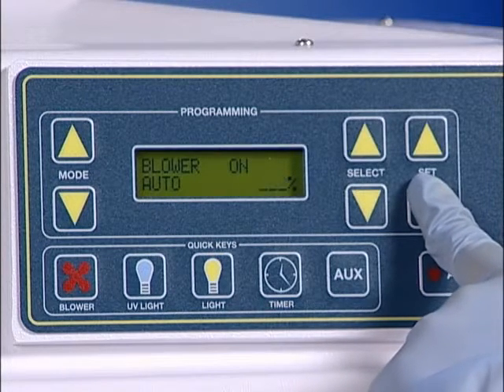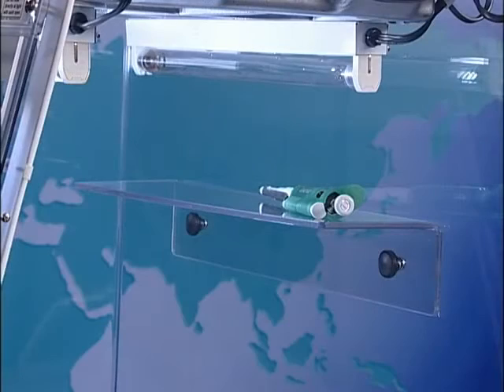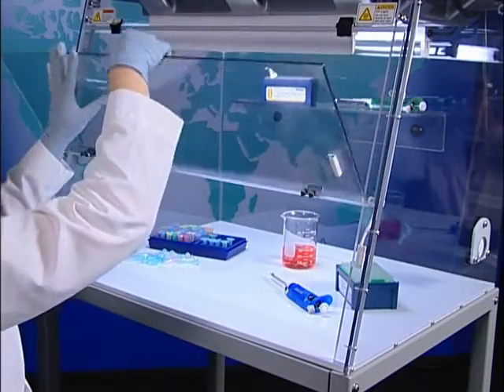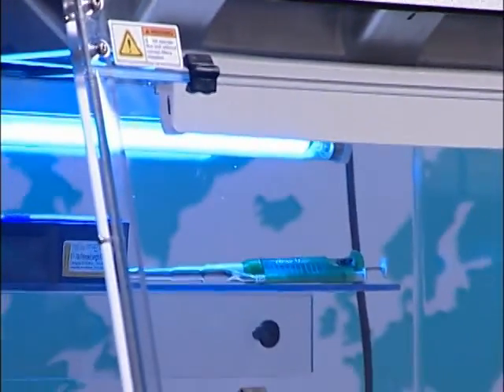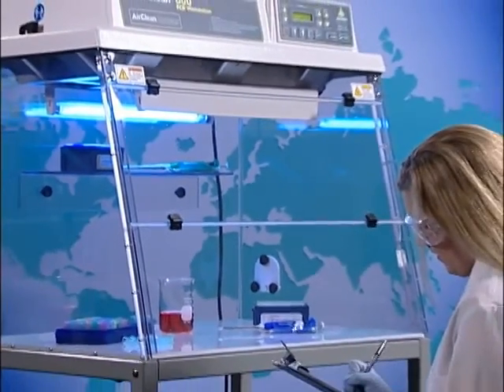Airflow in the combination workstation can be adjusted to complete absence. An optional UV shelf may be added to AirClean Systems PCR workstations where critical items need greater exposure to UV irradiation. The distance items are placed from the UV bulb is critical to the effectiveness of the UV energy — the closer the items are placed, the more intense the UV energy. The UV shelf is ideal for placing pipette tips and pipetters closer to the UV bulb for greater exposure.